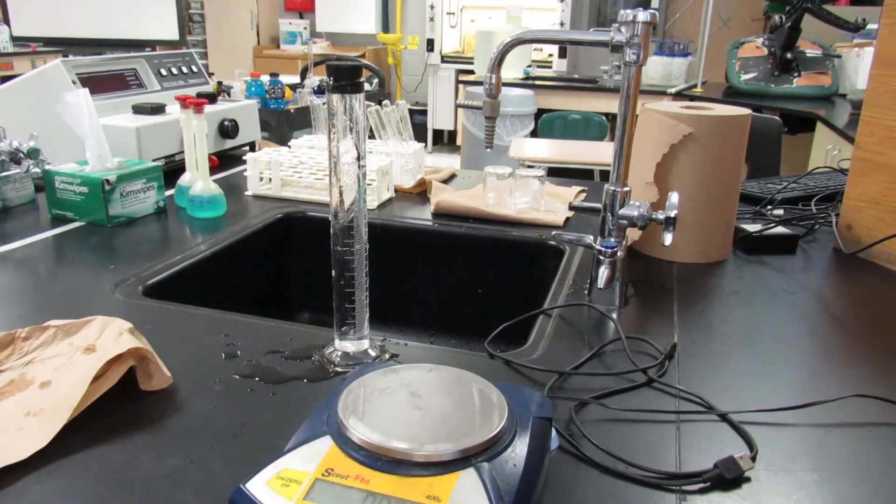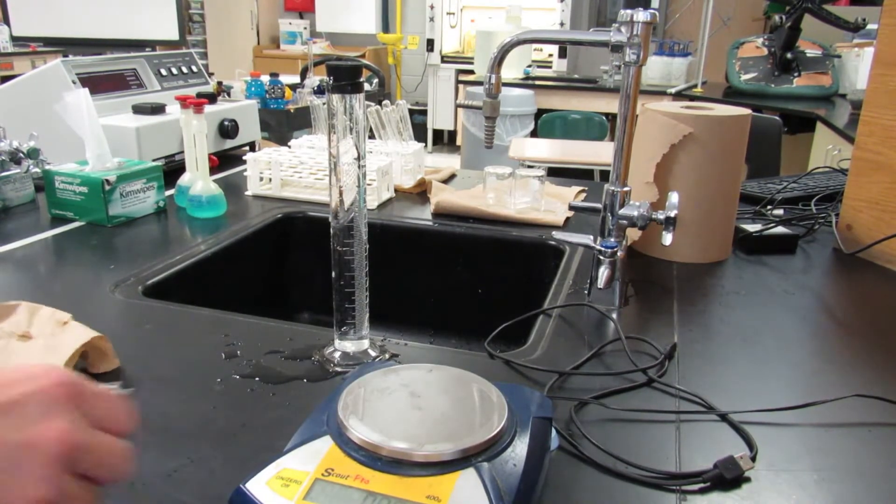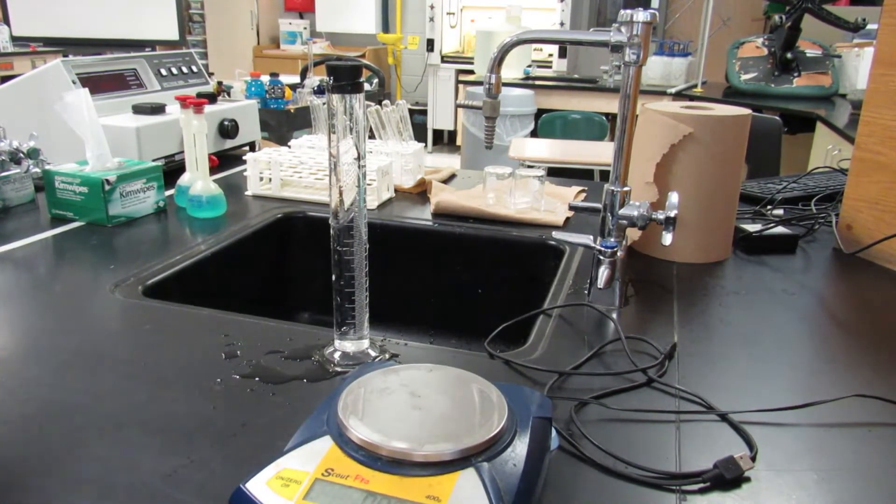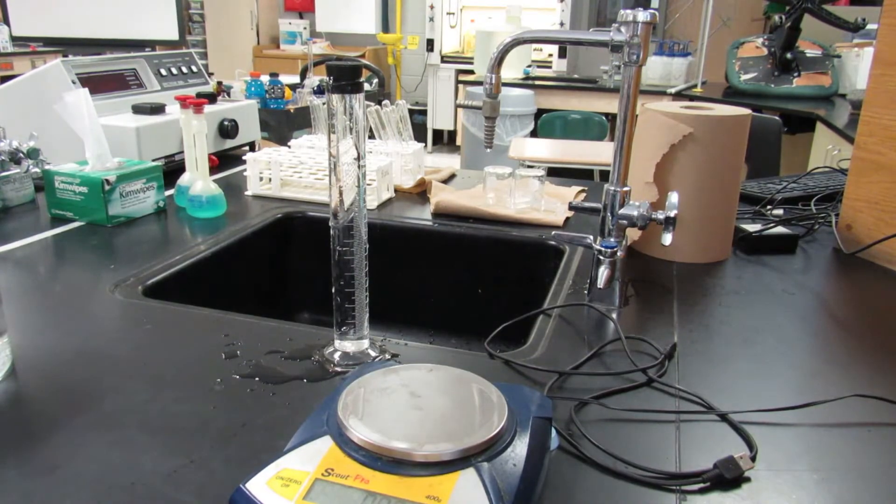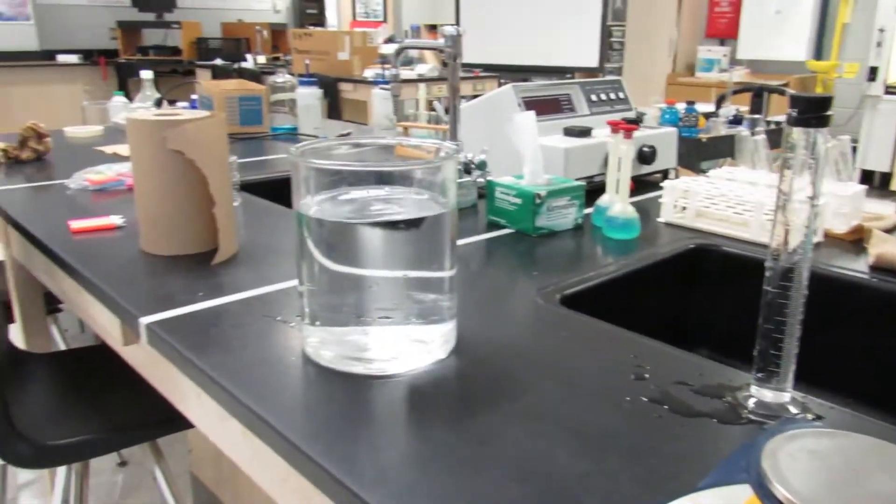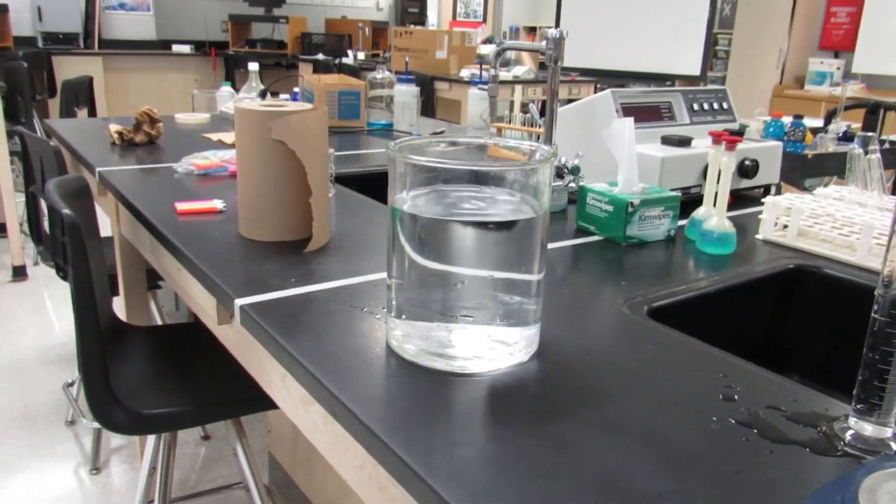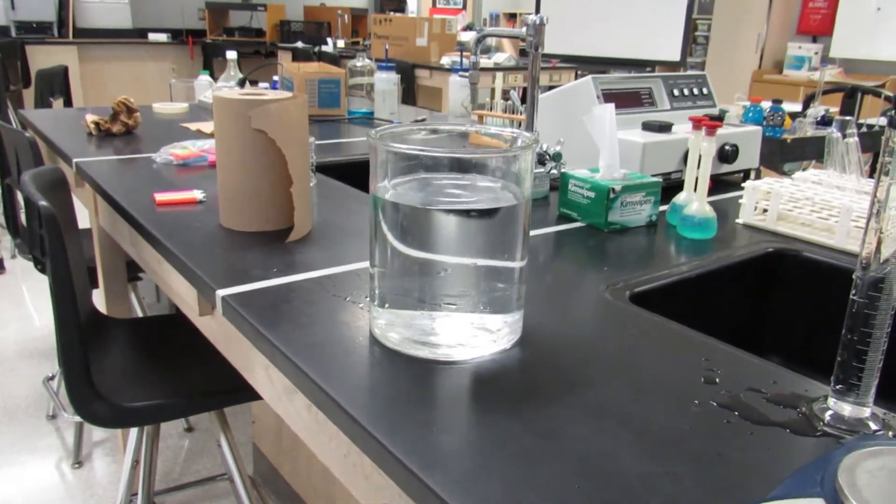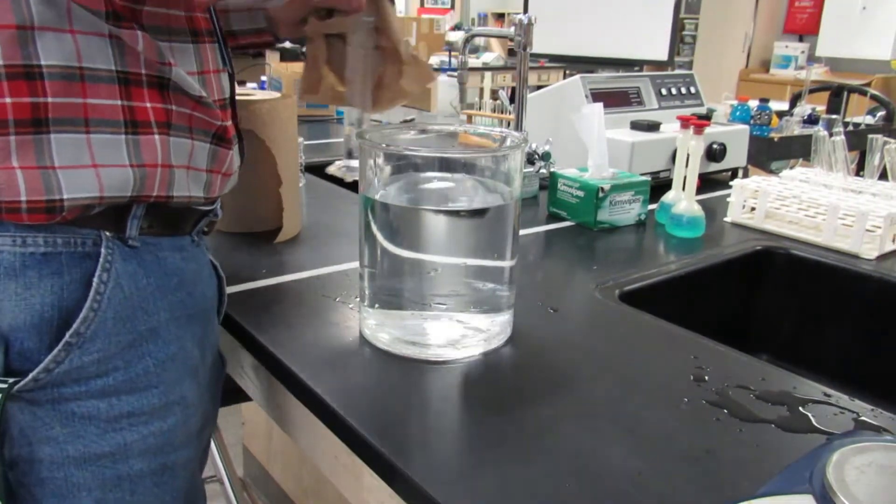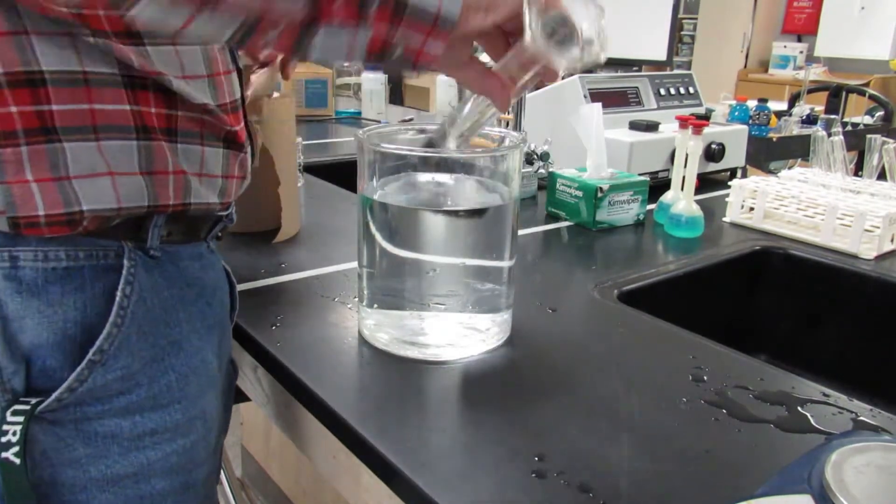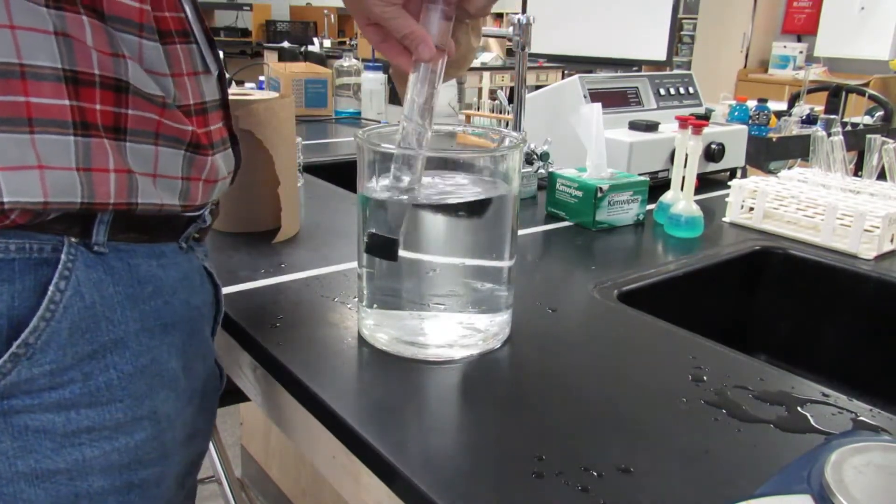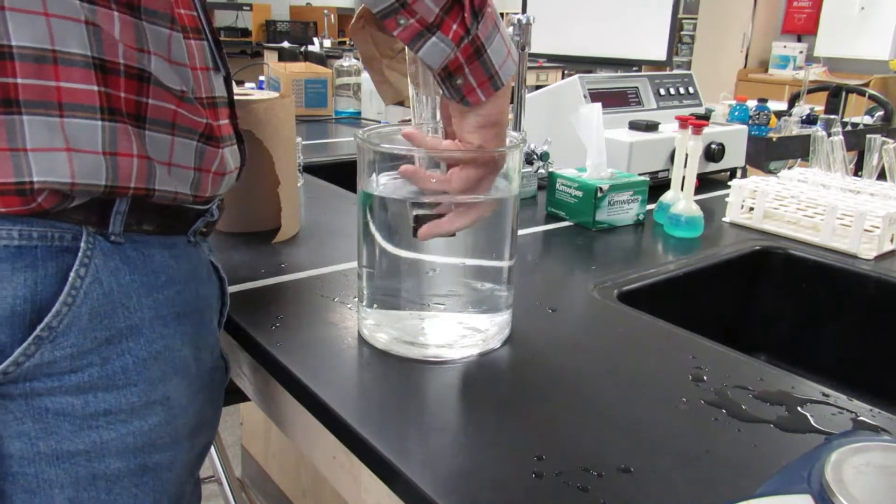Then we're going to take our battery jar and we're going to take our graduated cylinder we just filled with water, and we're going to flip it over into the battery jar quickly so that we don't get any air bubbles, and then remove the stopper.